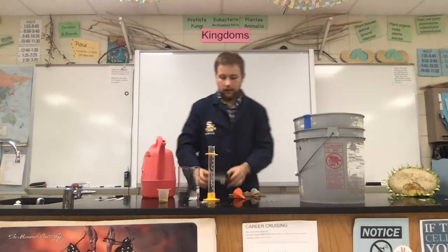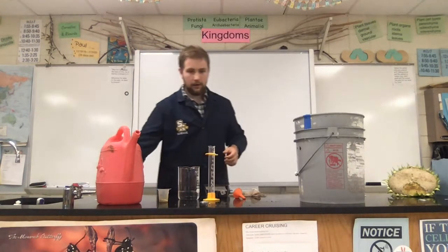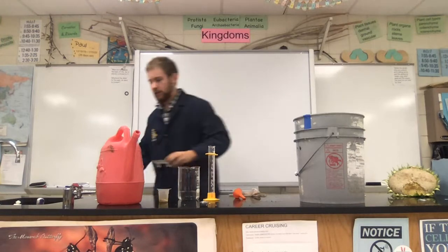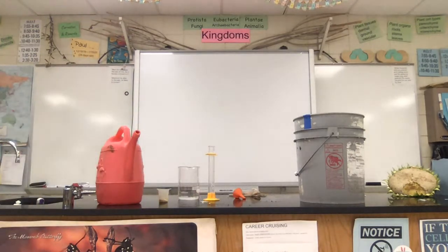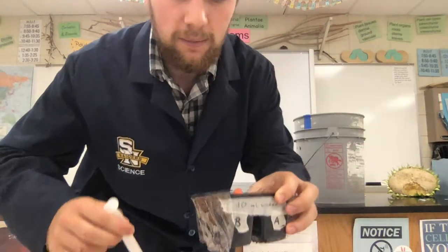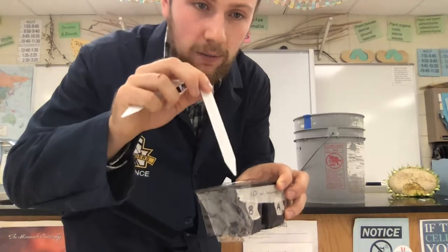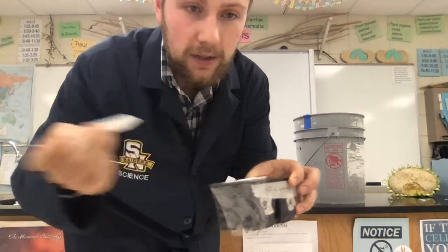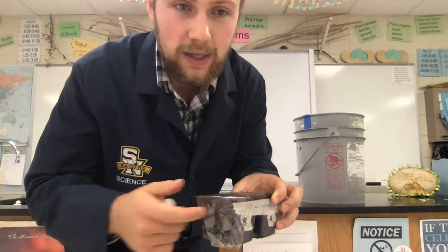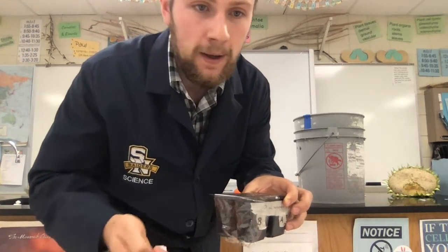And then one other quick note on how you can label your things. If you're ever wondering what these useful plastic sticks are for, if you hadn't used the tape, which we used on the front to mark 10 mils, 50 mils, you could go ahead and take a plastic stick, put it in there and maybe mark this one A and this one B, so on and so forth. Whatever way is best to label, it's probably more sustainable just to use tape. And that's what I did. I used tape for that reason.